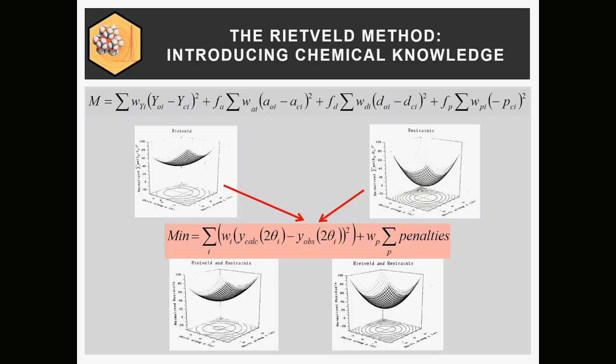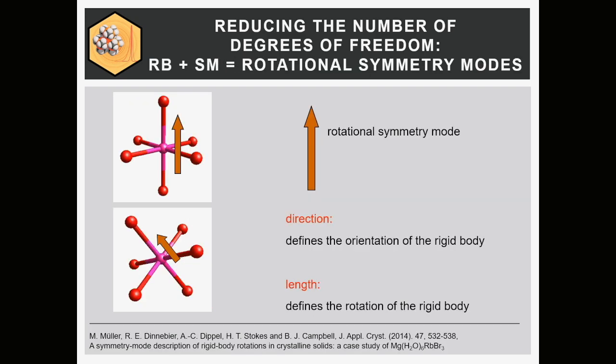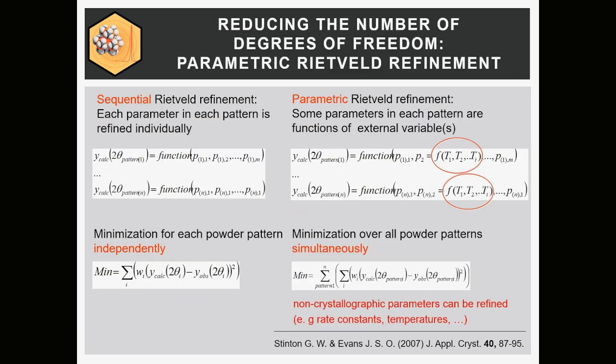But the 5 carbon atoms can move a little bit around. And this means your energy surface, your chi-squared surface, is getting sharper. But you should not artificially change it. It should not be at a higher or much lower value. This is basically given here. This is something we do not do here, so I just mentioned this.